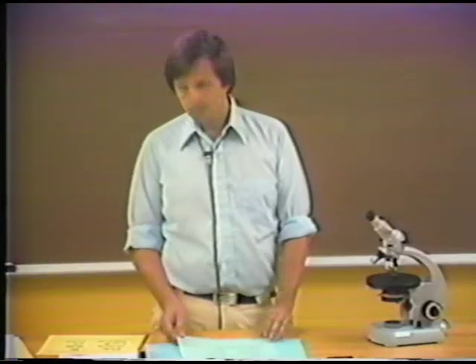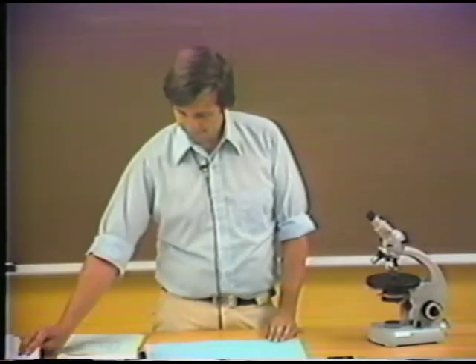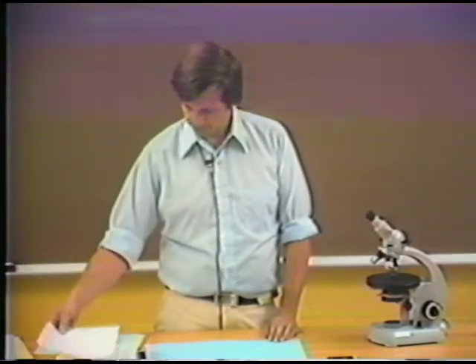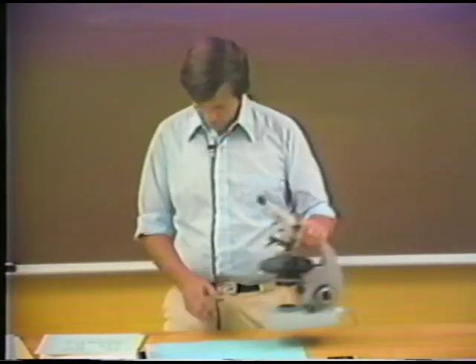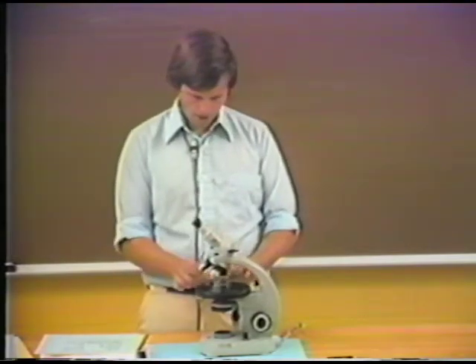Well, how do we tell the orientation of epsilon and omega? We can use the figure to tell us information about the uniaxial mineral. For example, let's go back to our quartz mount and our centered optic axis figure of quartz. And now we're looking at this centered optic axis figure.